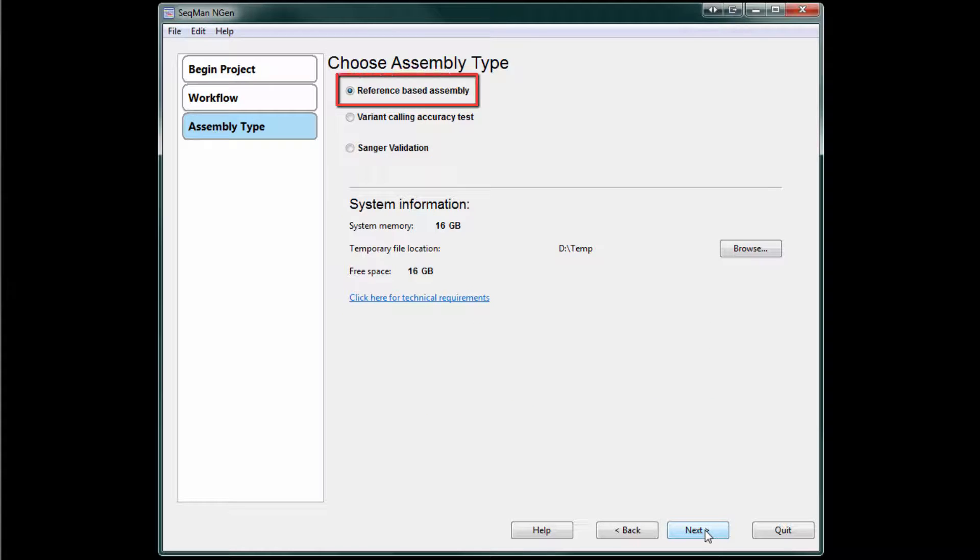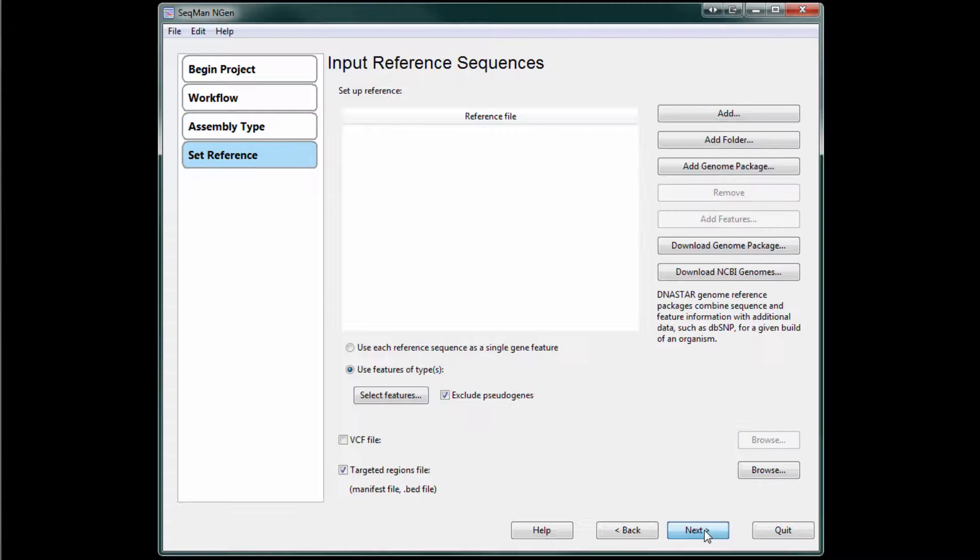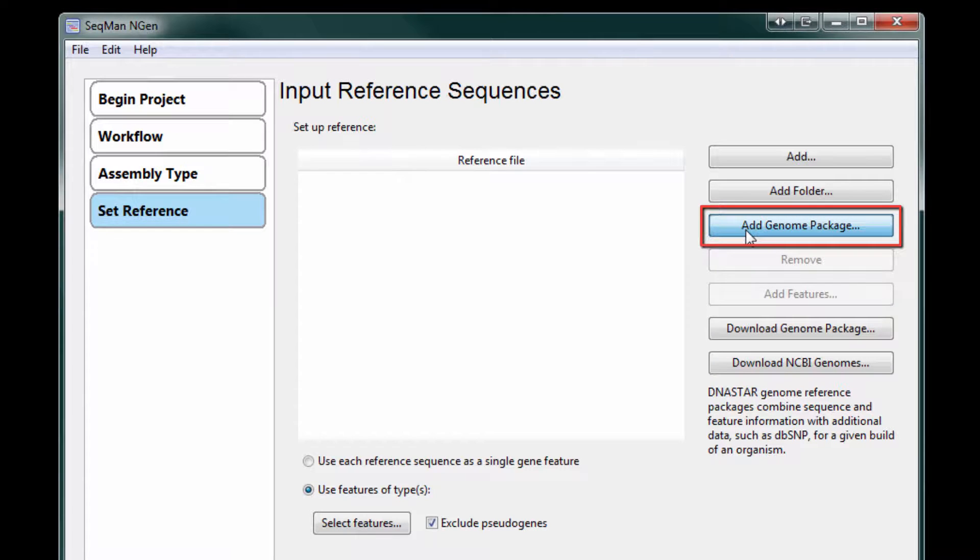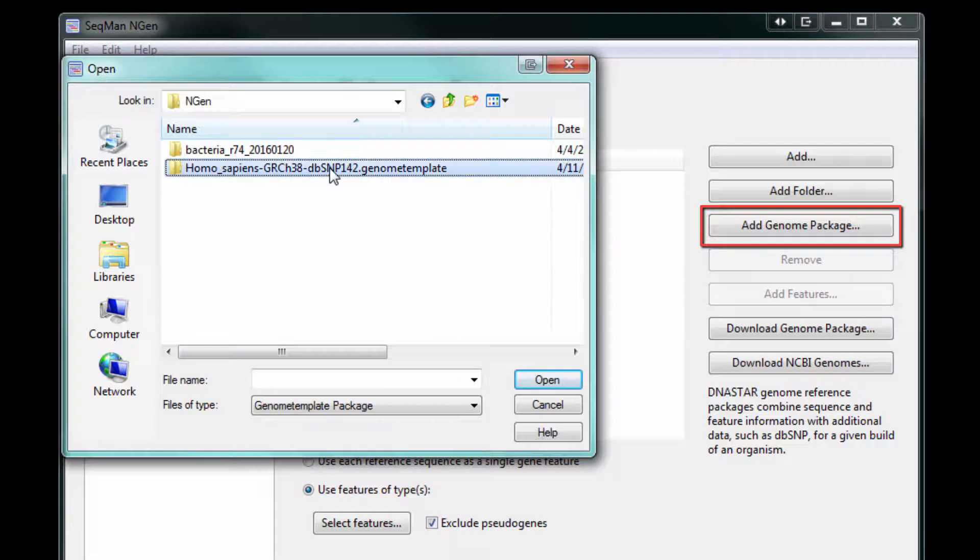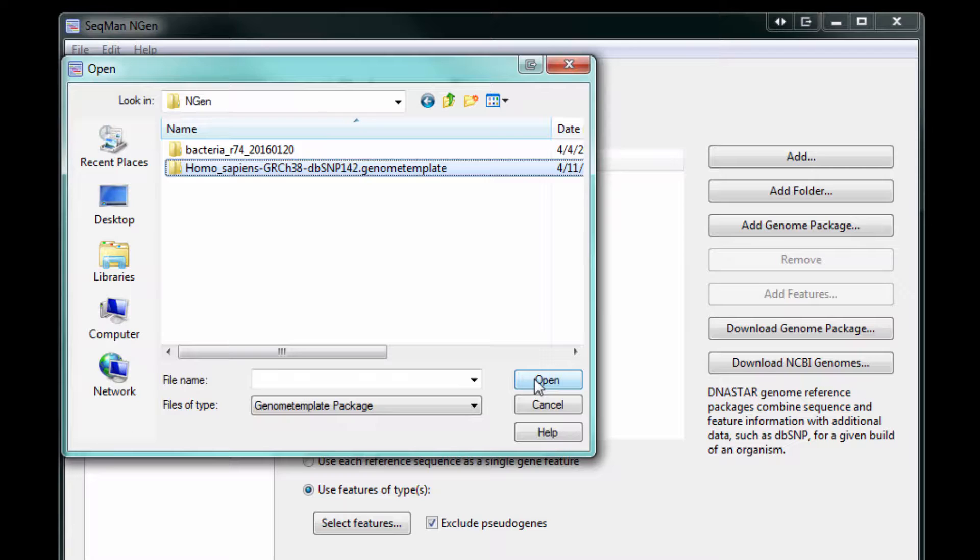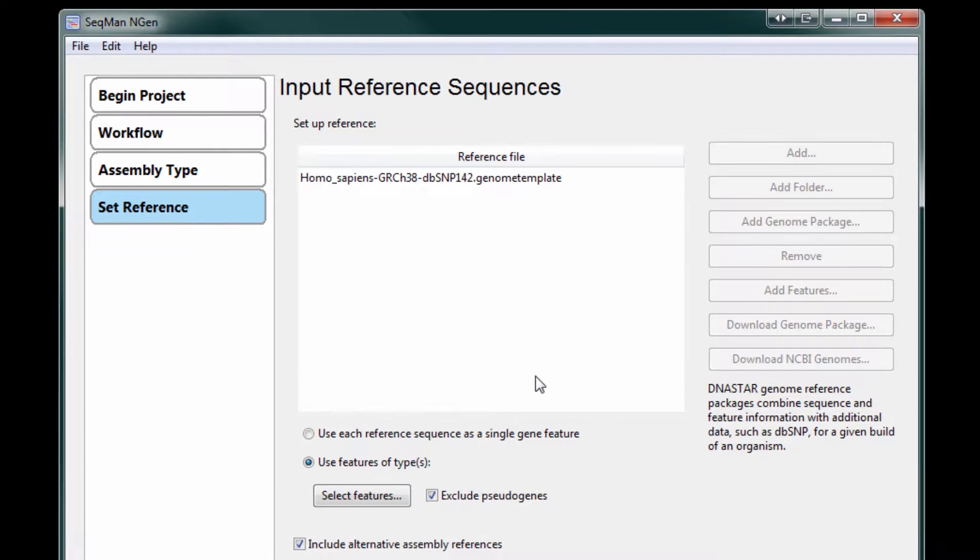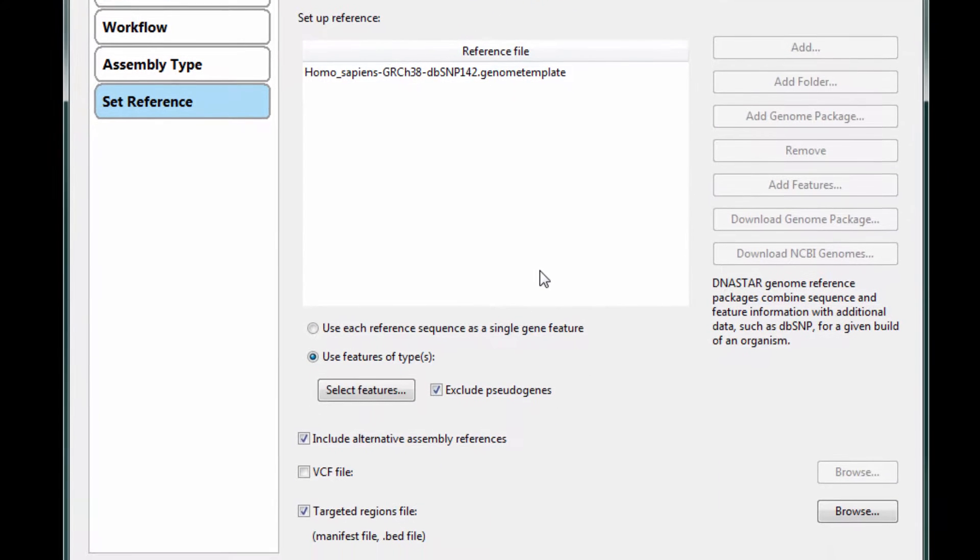Next, we'll select Reference Based Assembly and then load in our genome template. In this example, I'm going to be adding the Human Genome Template package that I previously downloaded from the DNA Star website.